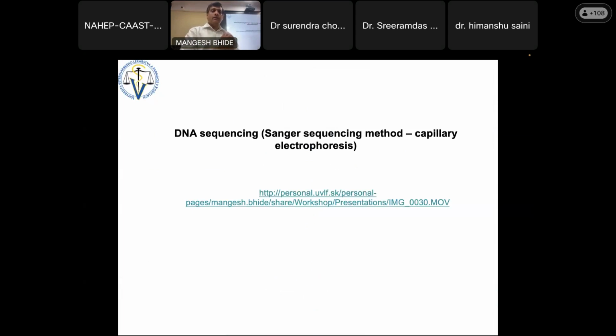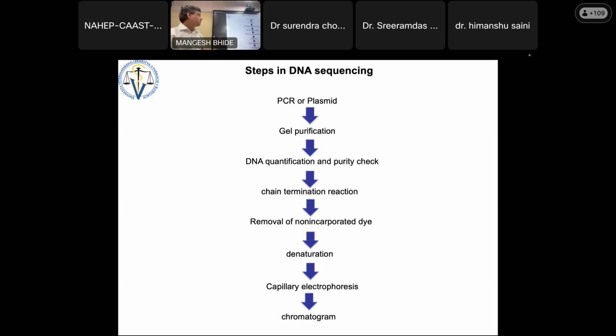So let's see. Do you want to take a photo? Okay, first let's see the basic principles of Sanger sequencing, and then I will run the video where some ideas will be clear. But as the video is fast, I will try to make a drawing over here, and then you will understand the video much better.